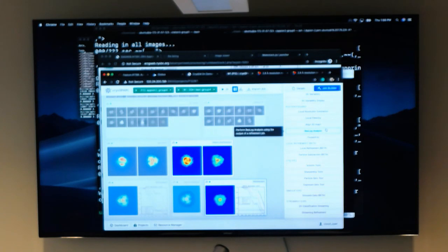The caution behind that is that it assumes you're adding of like kind. So I can say, oh great, I just have to add another 1,000 particles and I'll increase by another angstrom, and you add another 1,000 particles of 20 angstrom quality. Well, you're not going to improve resolution in that regime because you're just adding particles, not good particles.